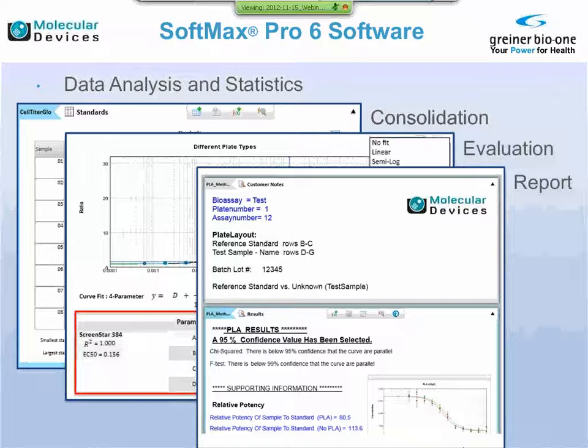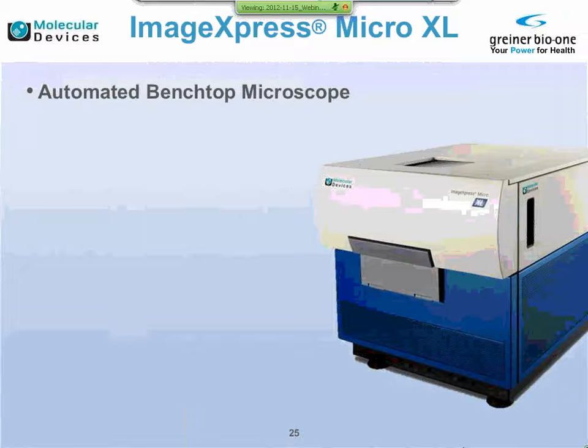And all these protocol sections can be saved as a template, and you can then later reuse them for other measurements and just import new data in there. And with this, I would like to hand over to Christian.